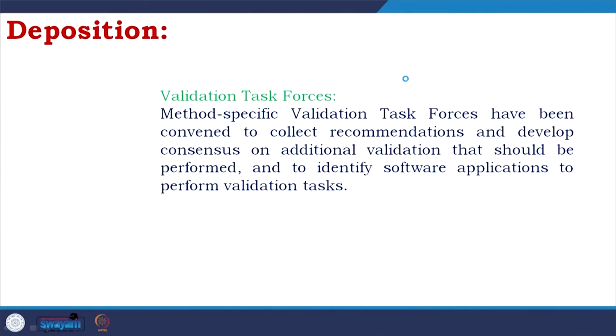Method specific validation task forces have been convened to collect recommendations and develop consensus on additional validation that should be performed and to identify software applications to perform validation tasks. I do not want to go into detail, but this is an area which is very critical. If you imagine when the first crystal structure, myoglobin, was solved, people never imagined that thousands, even millions of structures would have to be deposited, but now that is the case. So, there are validation task forces.